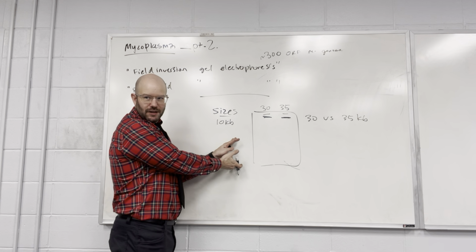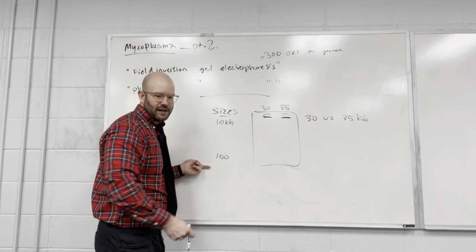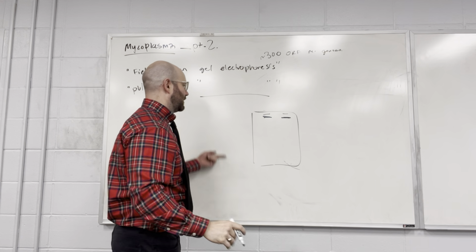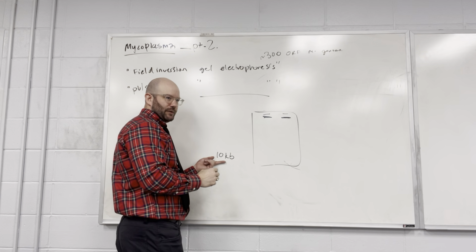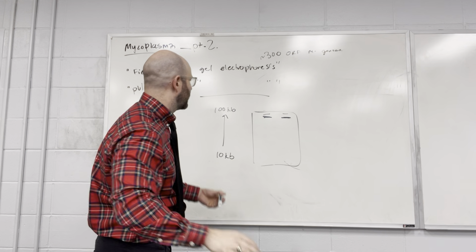This is a common thing in molecular biology where you learn the base way to do something, but then you realize there's a whole bunch of modifications to the protocol that you can do to make it work with other things. In this case, the sizes of the things they're working with are much, much greater than 10 kb. They're dealing with things at the very smallest almost 10 kb, up to 100 kb, and at the end, millions of base pairs.